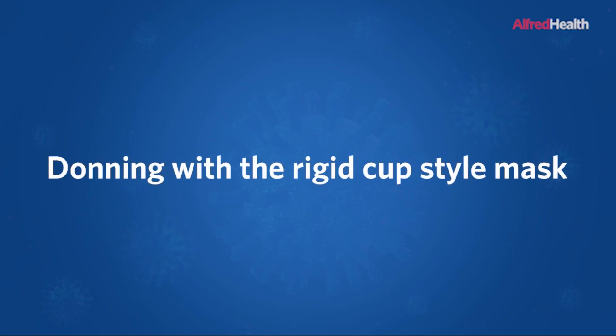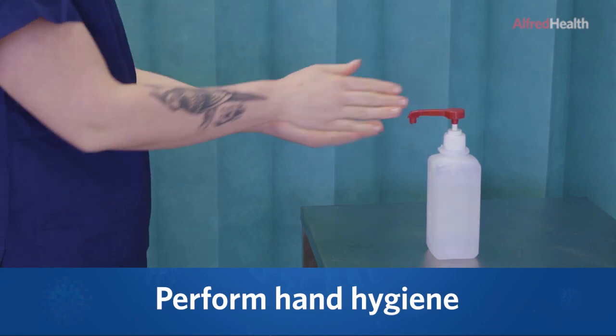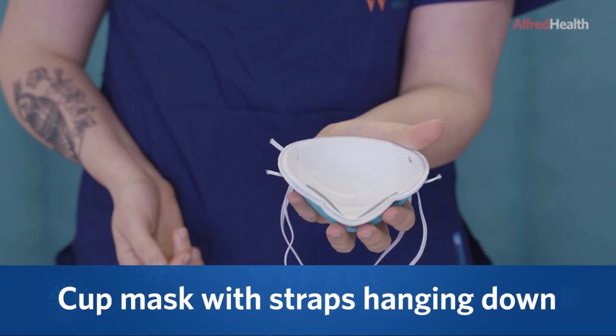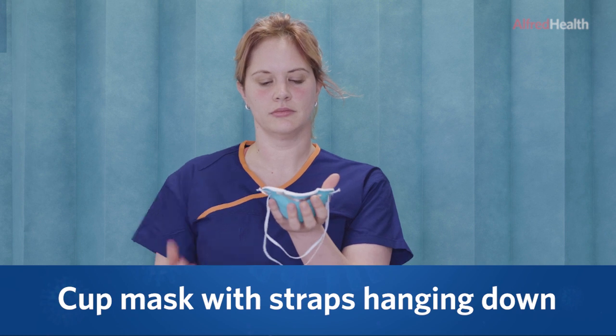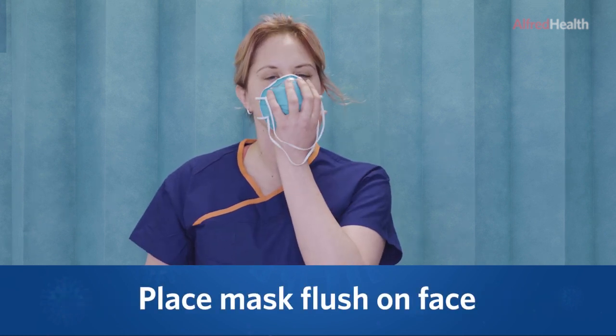Donning with a rigid cup style mask. Perform hand hygiene. Cup the mask in your hands with the straps hanging down. Place the mask flush on the face.